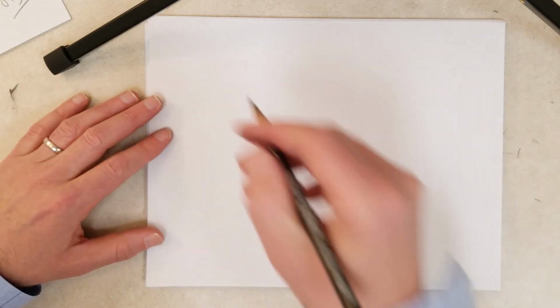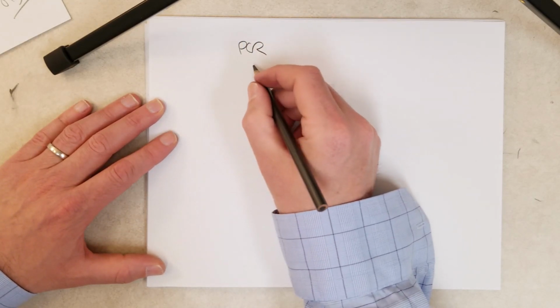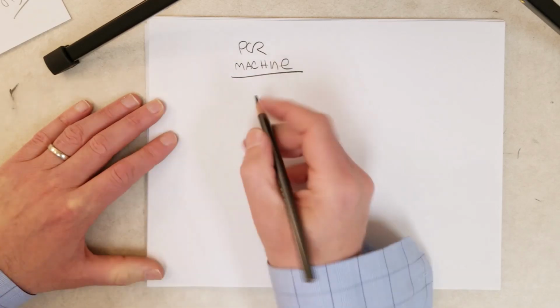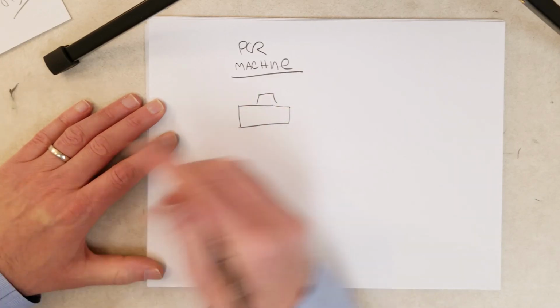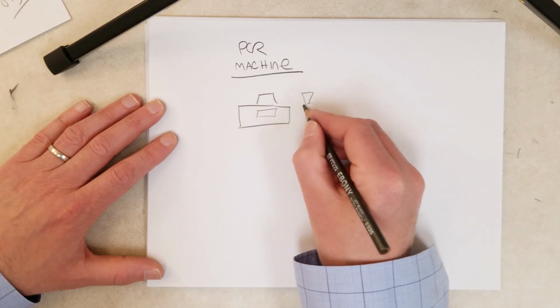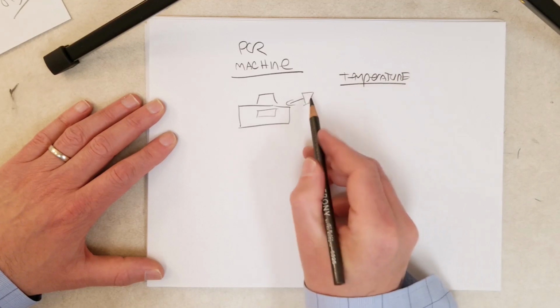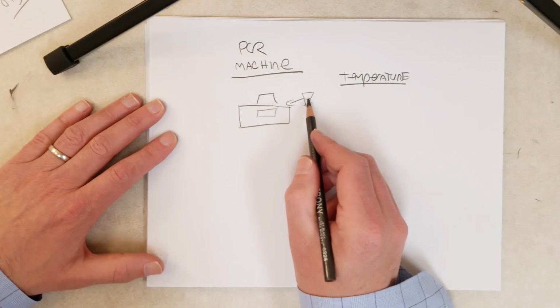So, a couple more things. You would perform a PCR reaction or a PCR assay in a PCR machine, also known as a thermal cycler. Essentially, it's a machine that's going to look something like this. It's pretty small, probably smaller than a standard microwave. You put your little PCR tubes in there, and what these machines do is they control the temperature. They're really good at heating these little tubes to specific temperatures really fast.